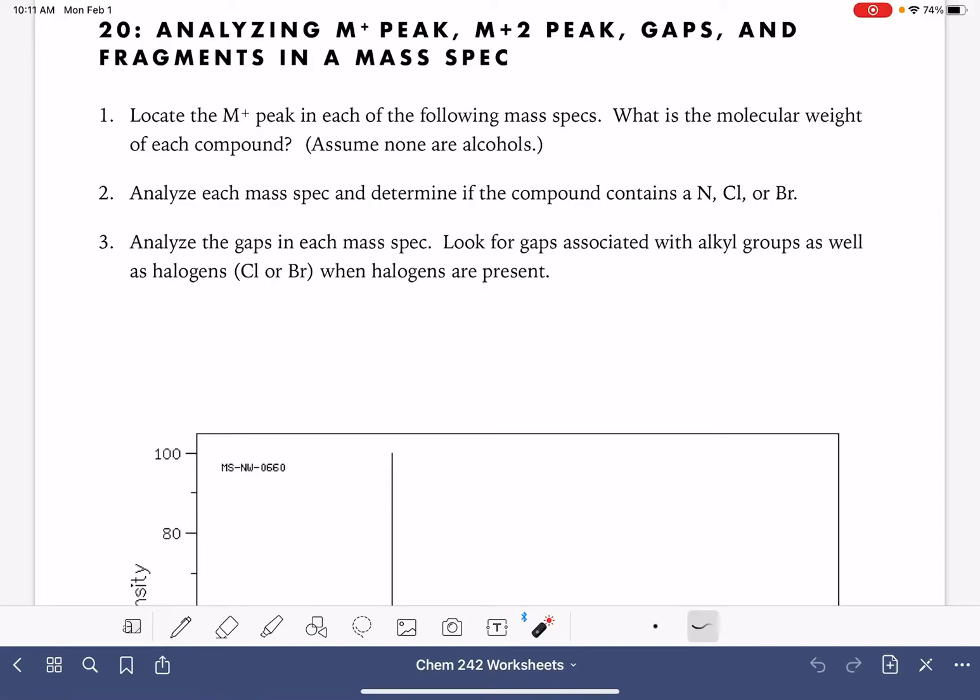In this video, we're going to practice analyzing mass spec data for five mass specs. We're going to locate the M plus peak, the molecular ion peak in each spectrum, and use it to determine the molecular weight.